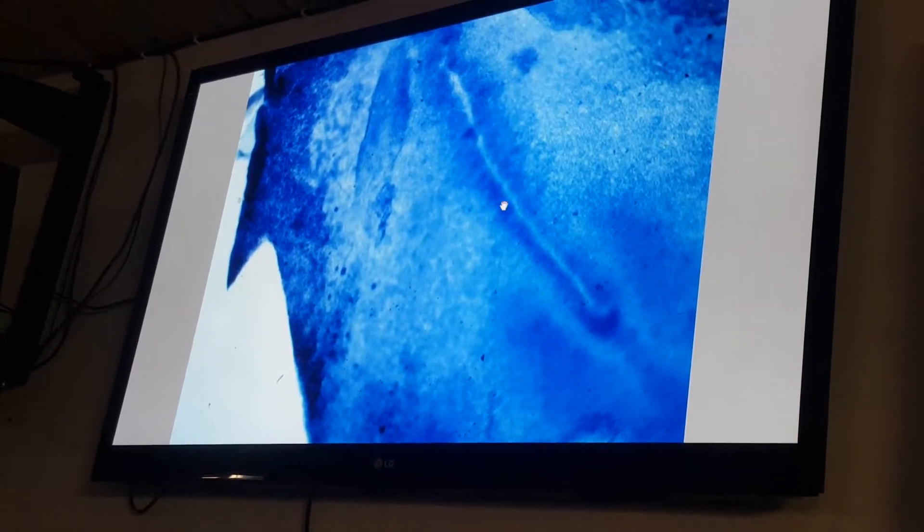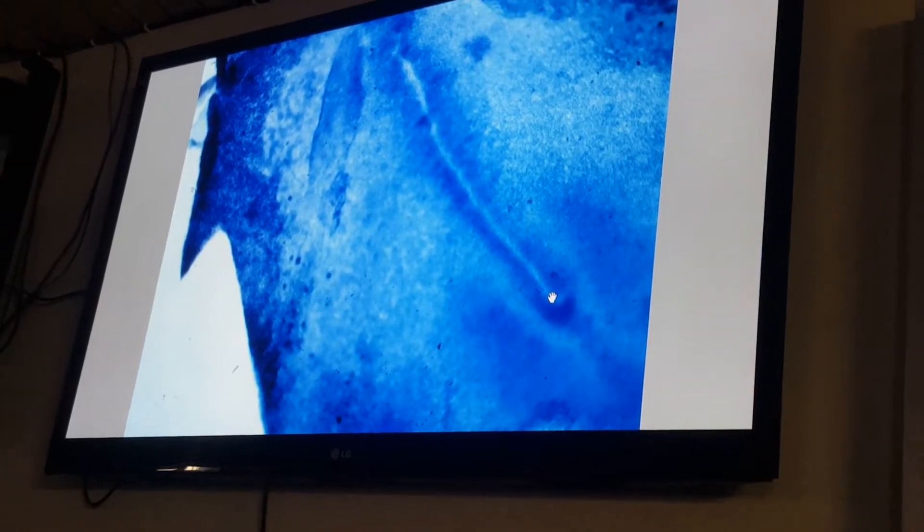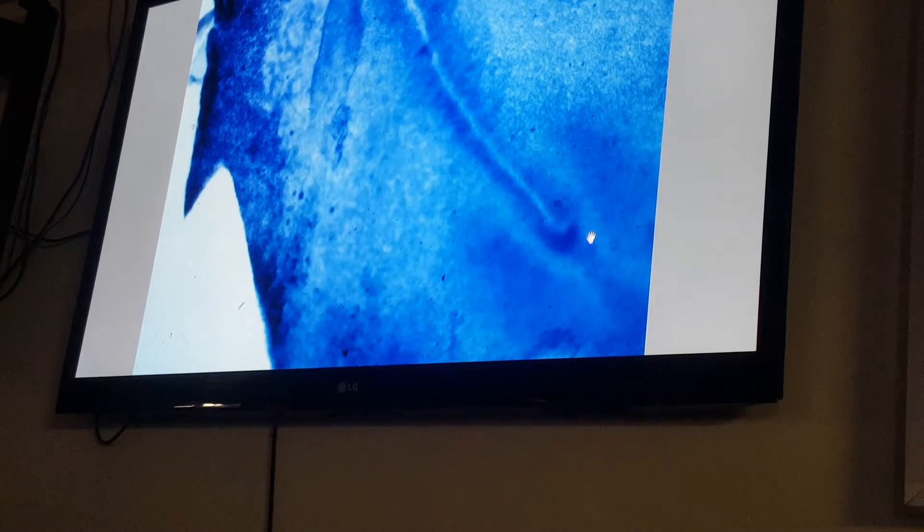And this slide shows the primitive streak and dorsal midline of the epiplast. This is epiplast. Primitive streak. The anterior end of the primitive streak is called primitive pit, surrounded by the thick layers of epiplast is called primitive knot.